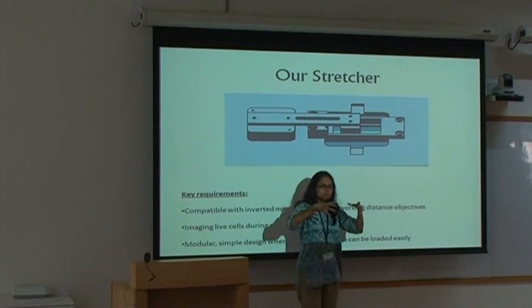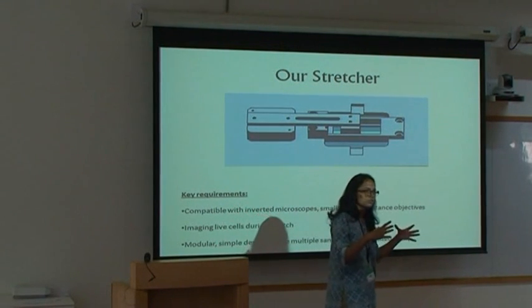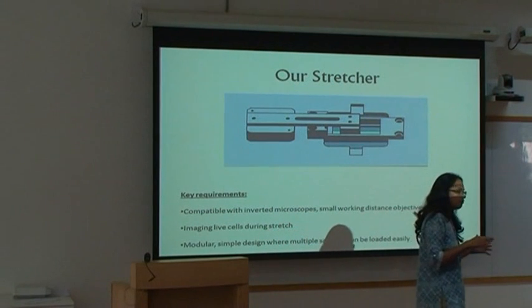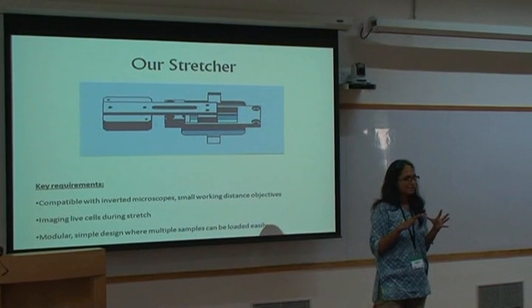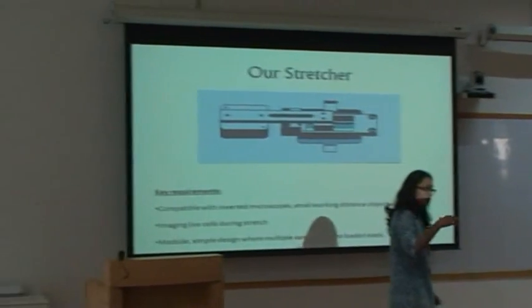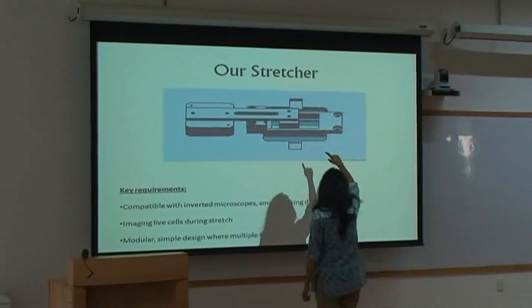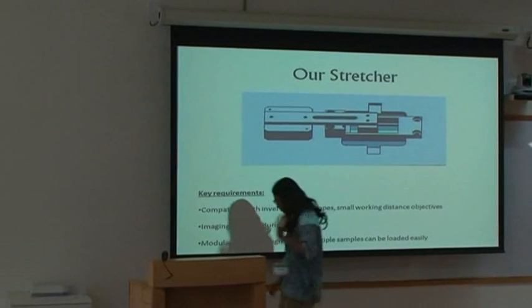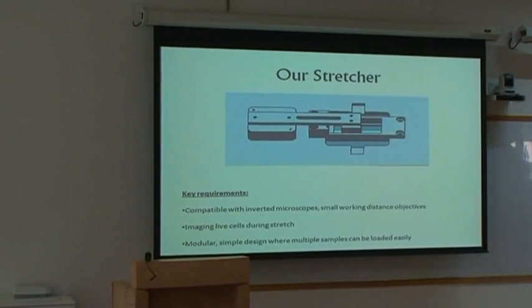This of course becomes a bit bulky. It's not so bulky, but still, if you just want to use it on the microscope, it's fine. If you want to put a 37-degree on-stage incubator on it, there's not much space around it. But we still want the thing to be heated. So again, I told you about dimensions, and let me just tell you, if I can find a marker, how we grow the cells.